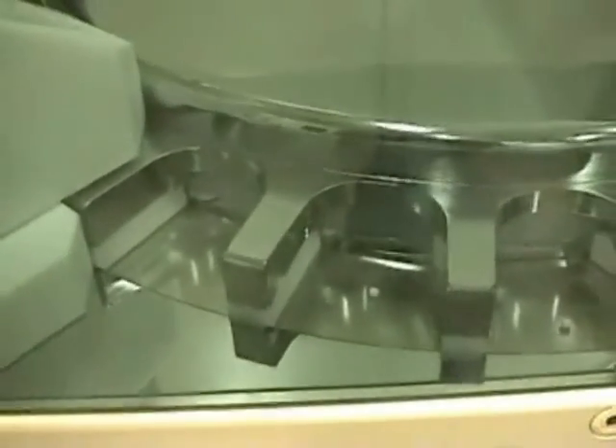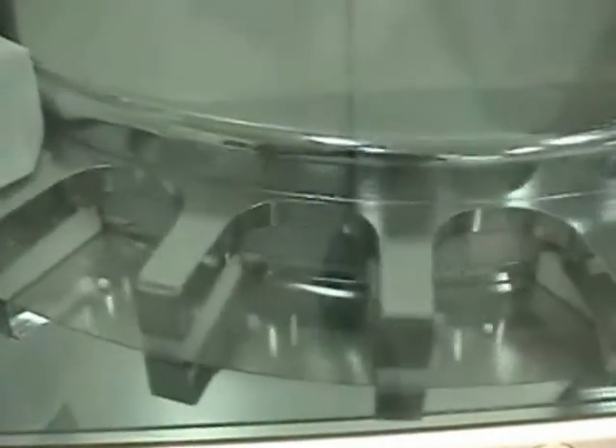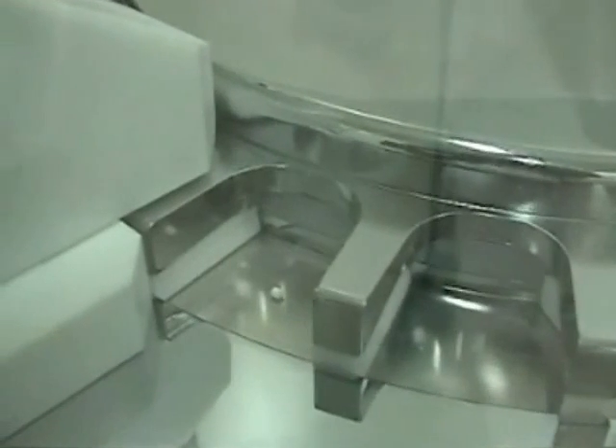The Kramer Electronic UTS 4.1 for MiniTabs. The UTS 4 MiniTabs is a standard Kramer 4.1 retrofitted with a special feeder and star wheel configuration specifically designed to help in the testing of mini tablets.